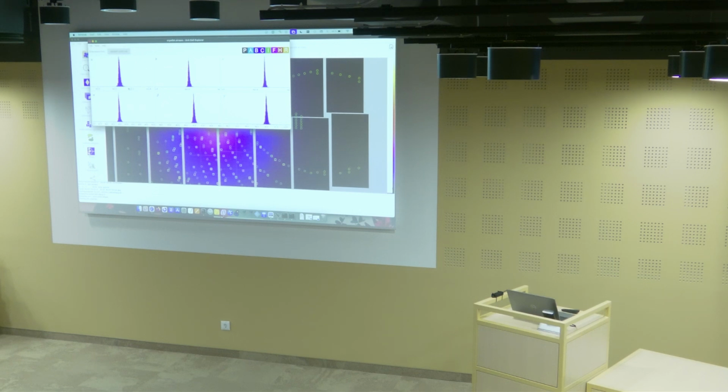What we can see is that we have a very sharp peak for every one of these unit cell parameters, and it is a symmetrical peak. If that peak were skewed, it would mostly be a sign that your geometry has a problem. Now, we can select these peaks.